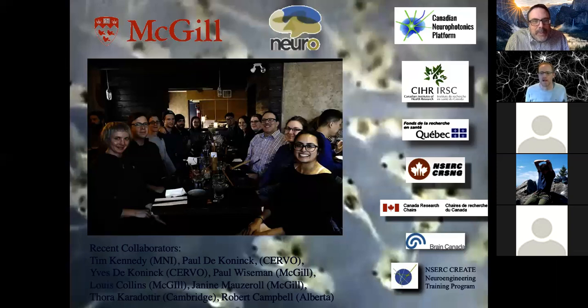One of the things we've struggled with is in these LPS-reared zebrafish. We've done calcium imaging analysis of receptive fields and visual response properties and stuff like that, but it's been an exercise in data mining trying to get effects out of that. We ultimately ended up filtering the data to the point where we were only looking at cells with orientation preferences or certain spatial frequency preferences, and then asking how they change. It really ended up being a heavily filtered data set to get anything meaningful out of it. And I think part of that has to do with the fact that we're not asking the right questions. Well, that ends up often being the case.